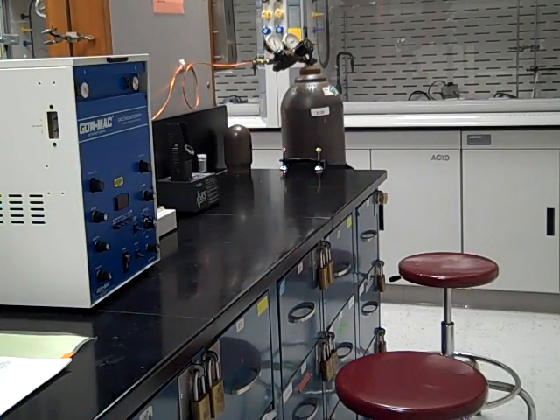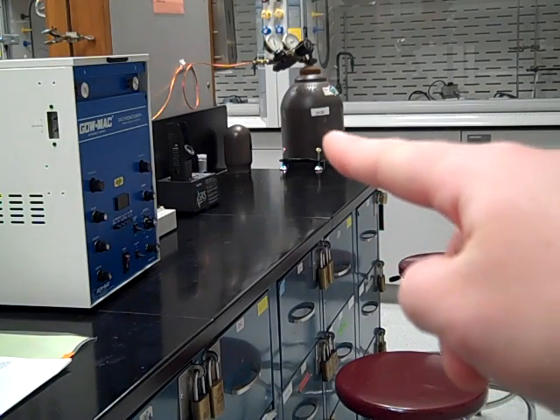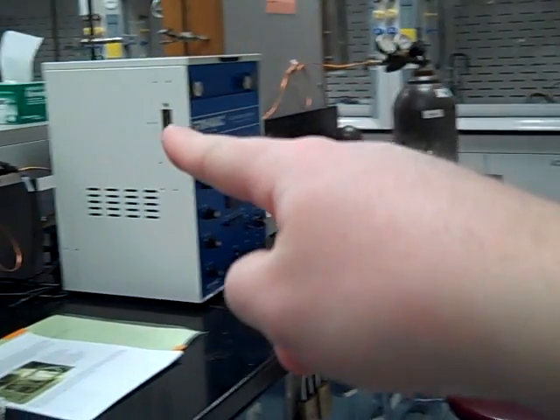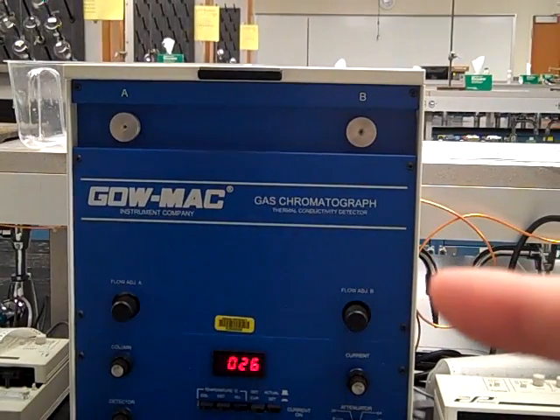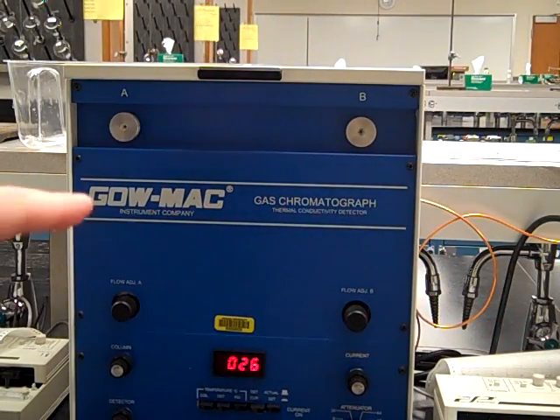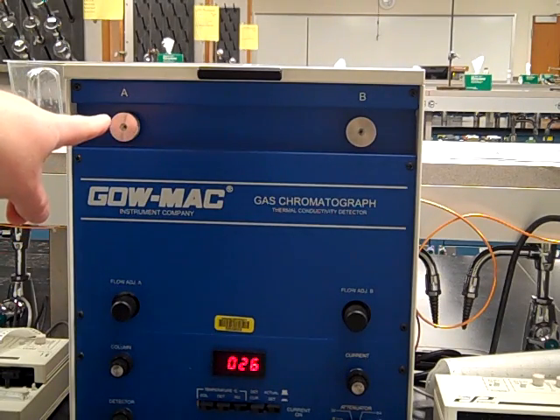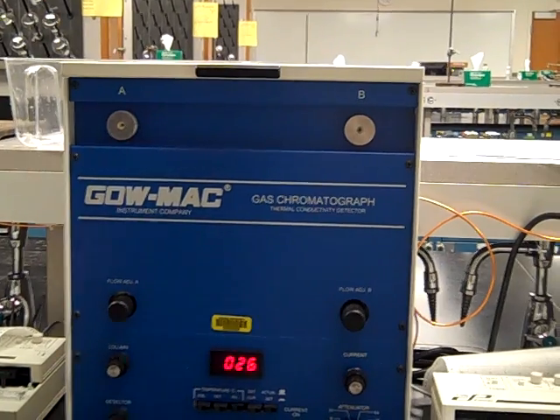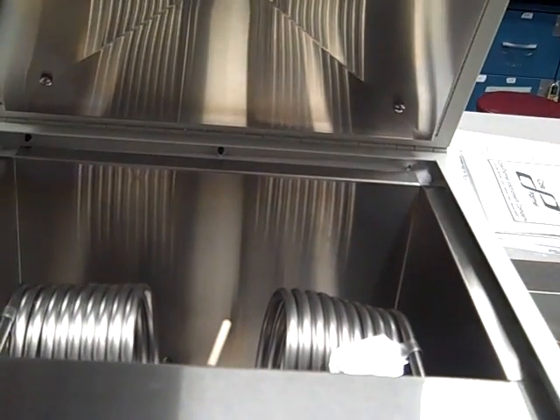Like I showed in the PowerPoints, the gas cylinder is over there, so that contains helium. And then those copper tubes that you can see running along connect all these Gaumac GCs with helium. So on the front here is the injection port. That's where you'll be injecting your sample. And then once you inject that and it volatilizes, that will be put into the columns which you can see there.